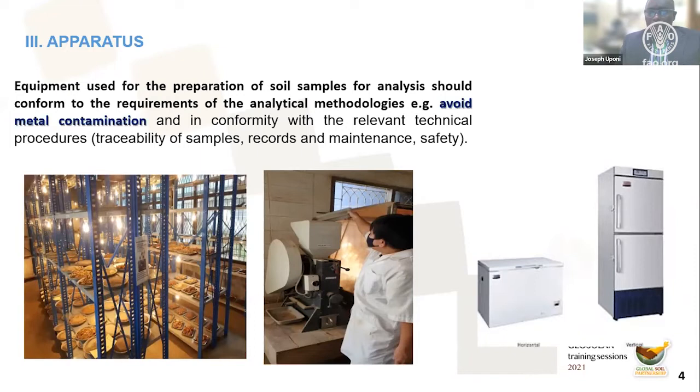And also, oftentimes, because the samples come from different fields, proper records must be kept and in such a way as to be able to trace the samples as they go along the process of analysis in the lab.